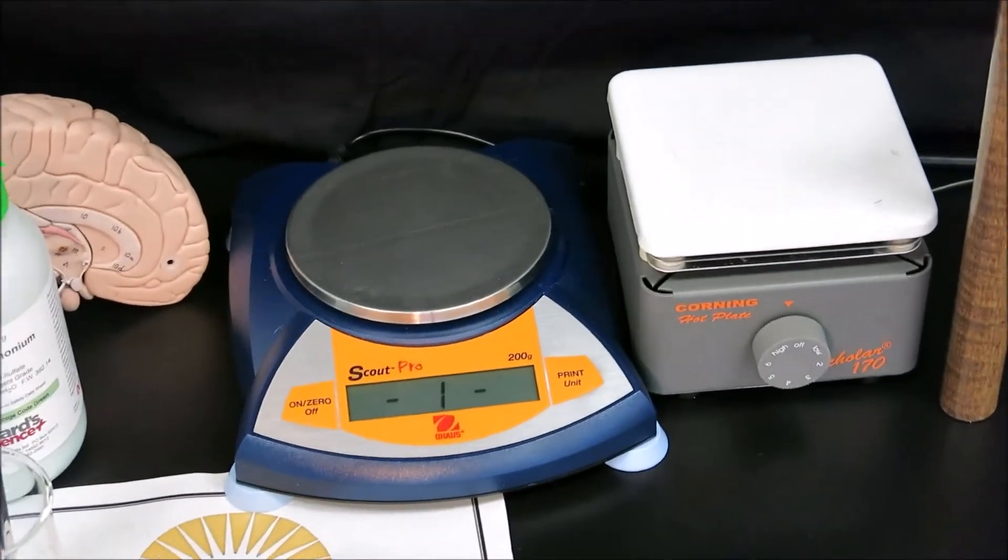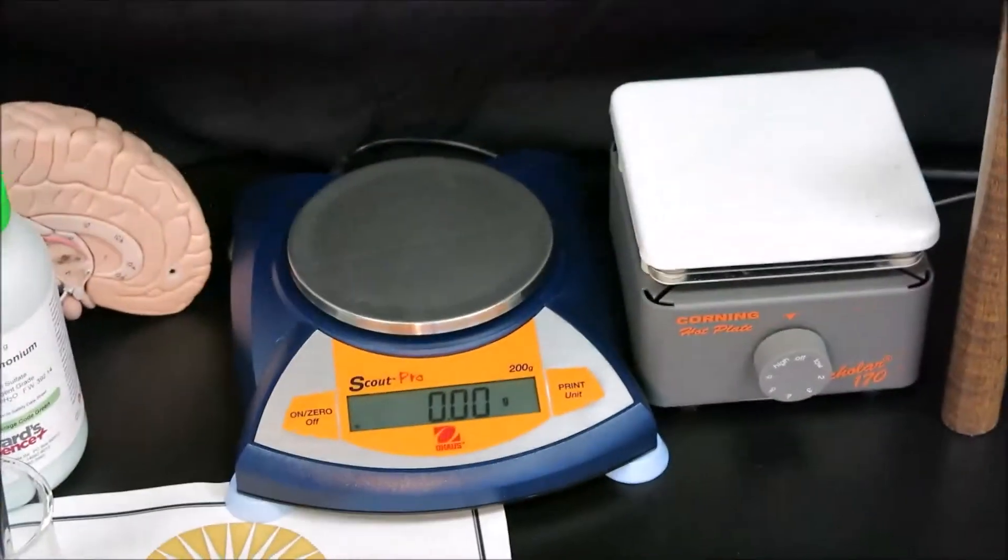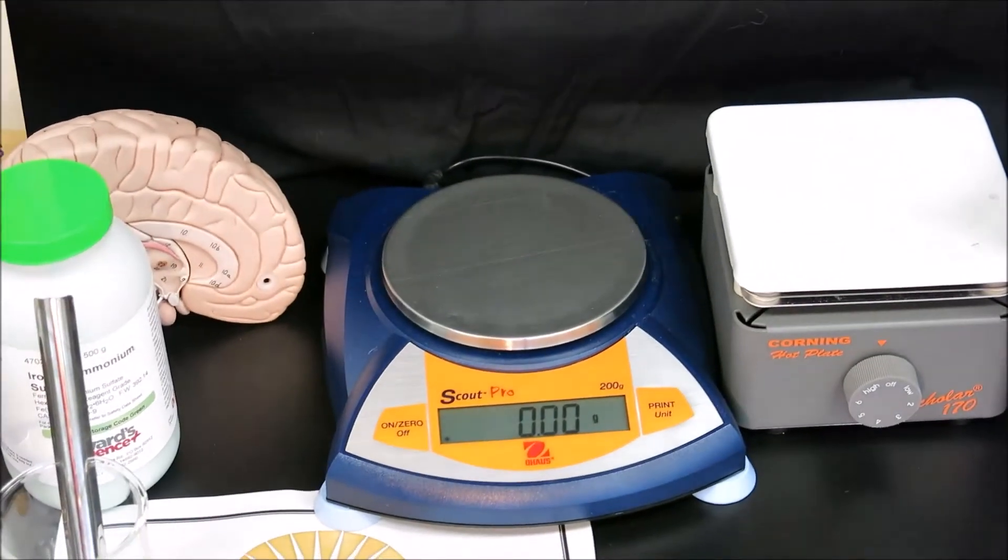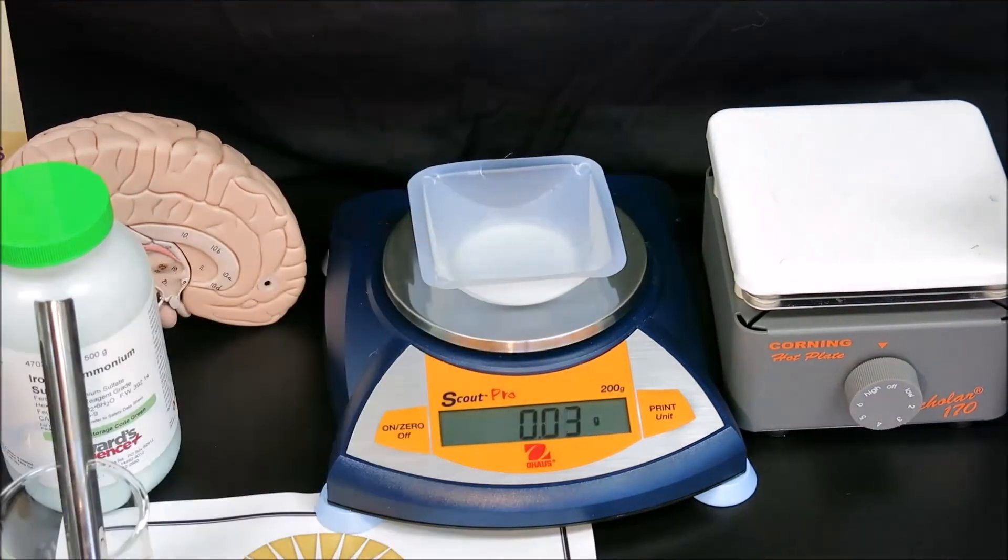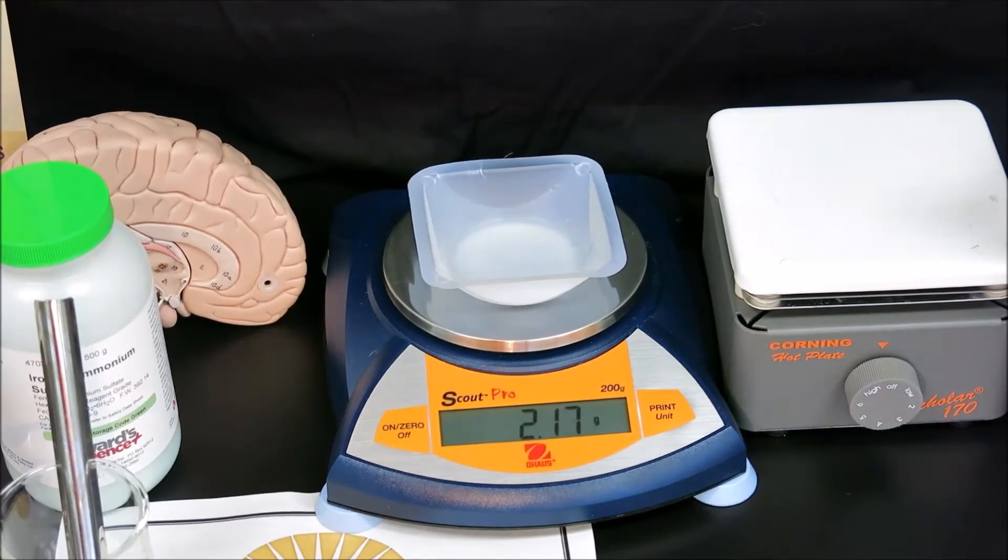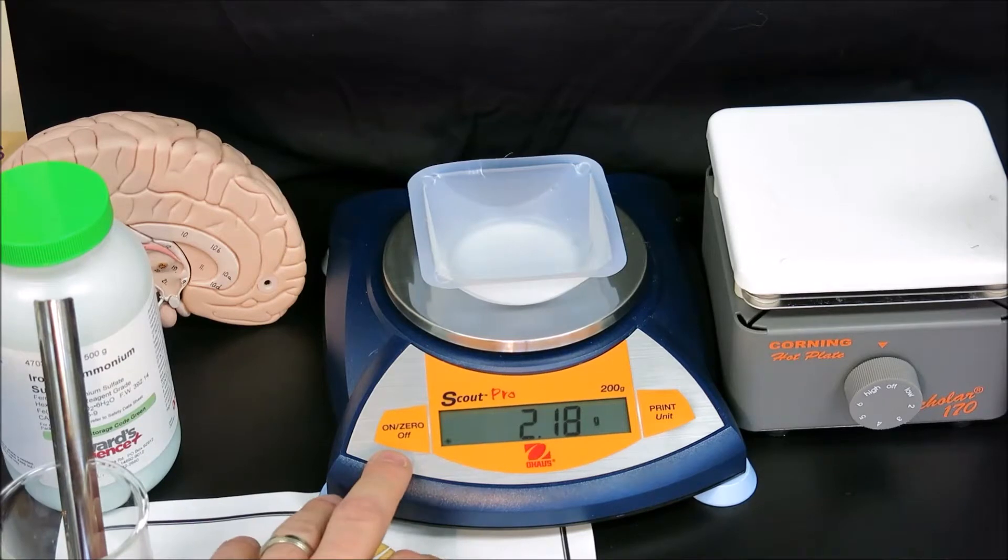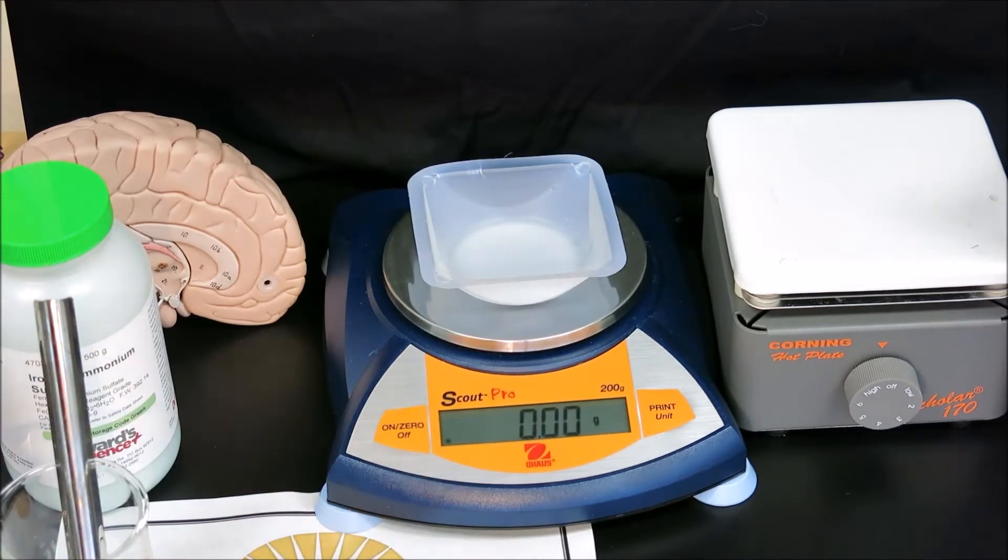or zero the scale, in order for it to record only the mass of the solid and not the weigh boat. The weigh boat has a mass of 2.18 grams. We'll hit zero or tare, and that zeros the scale. Now we can add our solid.